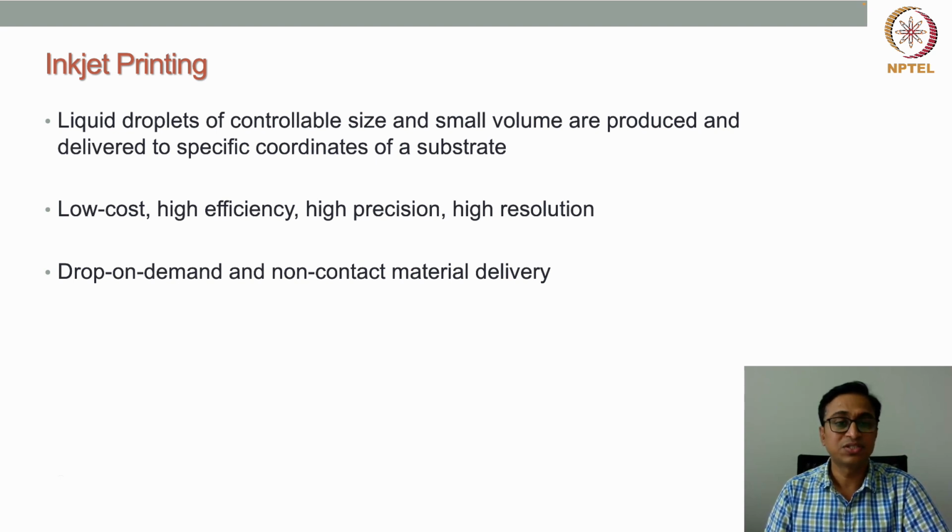That's why this printing technology is highly popular because of all these advantages: it is low cost, high efficiency, high precision, and high resolution.